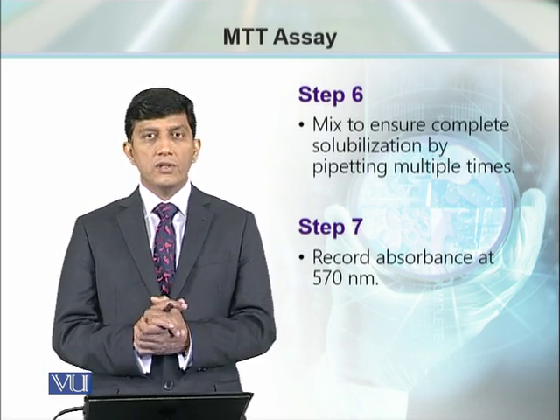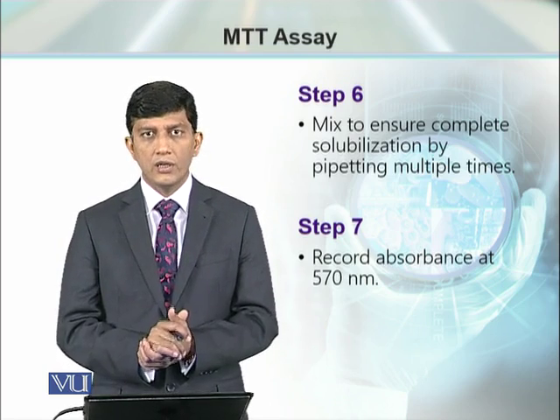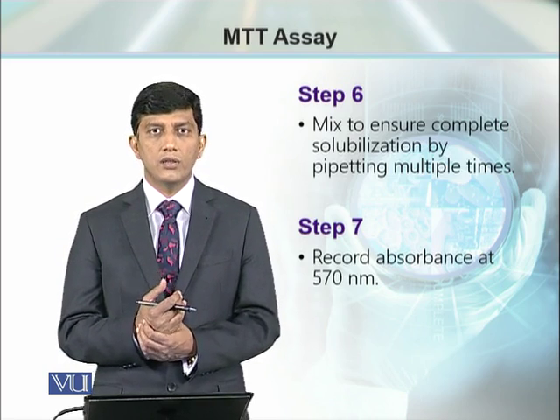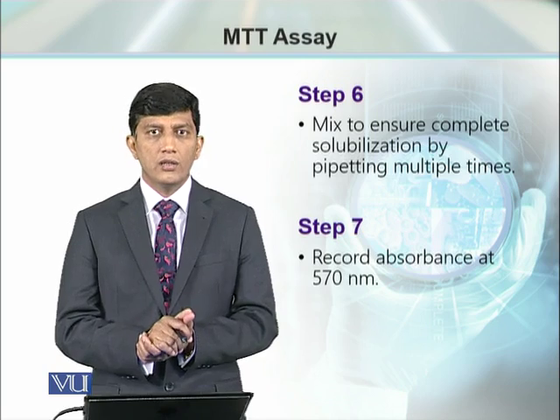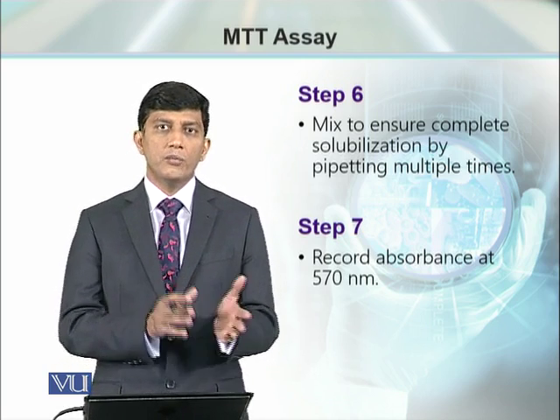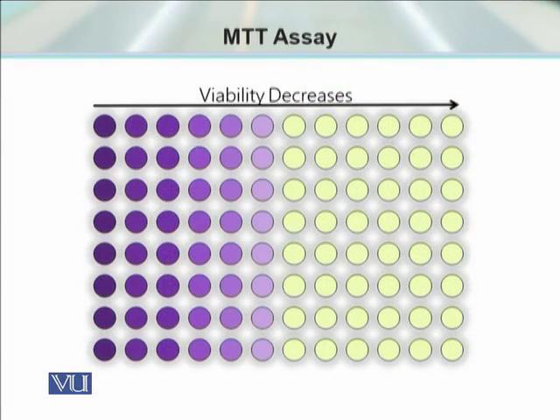And now this is the time for recording the absorbance. The color intensity can be seen changing in the particular wells of the 96 well plate. The absorbance can be read in the microplate reader, and the results can be seen, as well as the optical density values, which can be obtained by a pre-programmed optical density calculator.